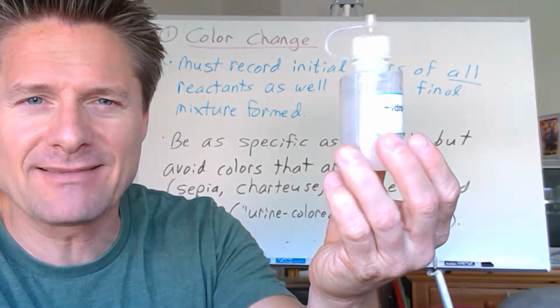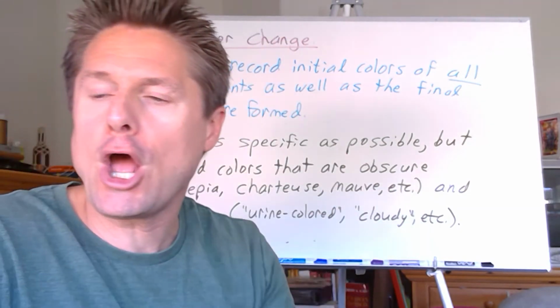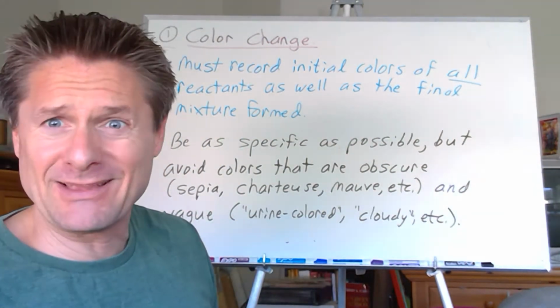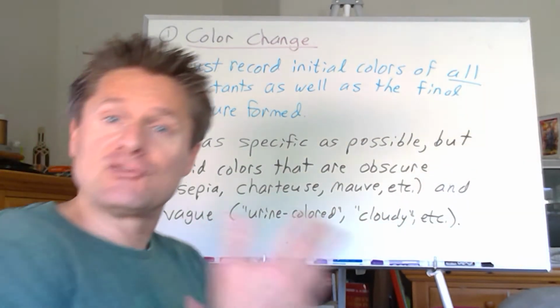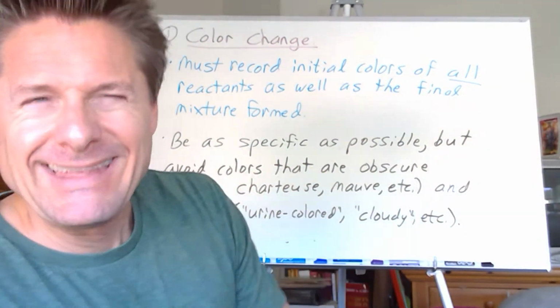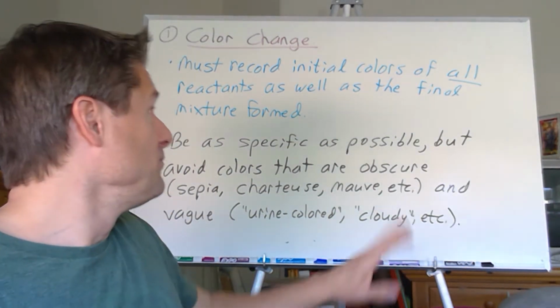This is hydrochloric acid, so that's a colorless solution. There's no color to it. If you mix two colorless solutions and you get something that's purple or brown or black, well, hello, that must have been some kind of change in the atomic arrangements, creating a new substance. That's a chemical change. Now, it can be kind of silly, but I've seen it happen in undergraduate laboratories.